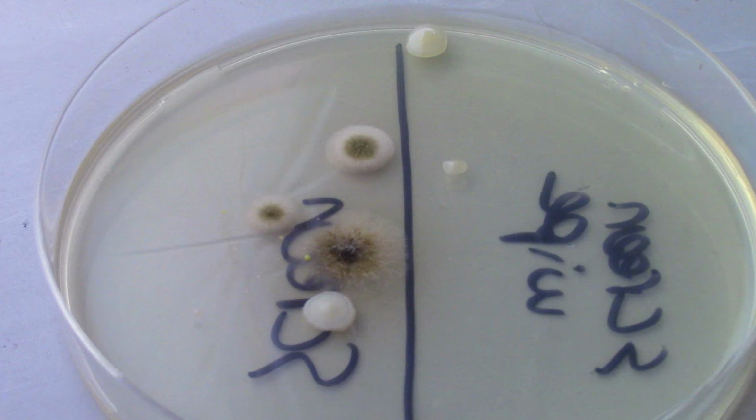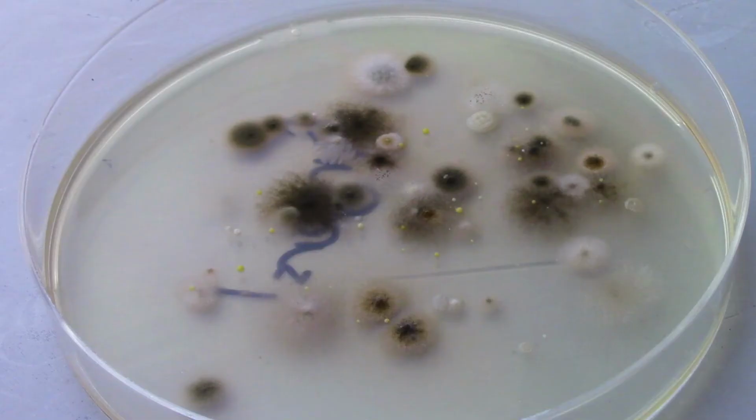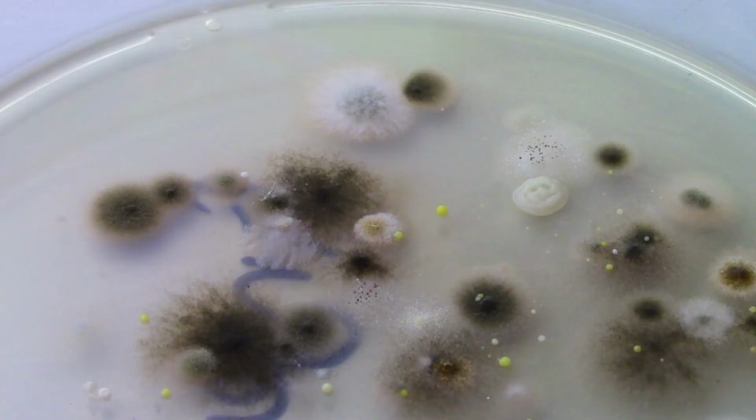But the one on the very edge on the back, I'm not sure about that one. It might have been something in the air. It might have been a droplet of water that I didn't notice, but it doesn't actually connect to the areas that I swabbed. So that was kind of weird to me. It's a little closer up. Ugh, my fingers are so gross. I mean, we're all gross. A little closer up. A little closer yet.